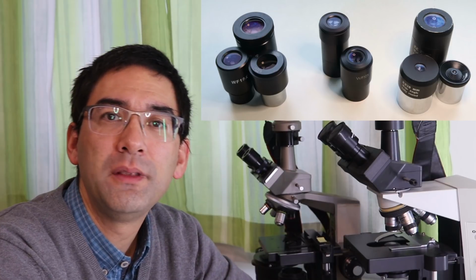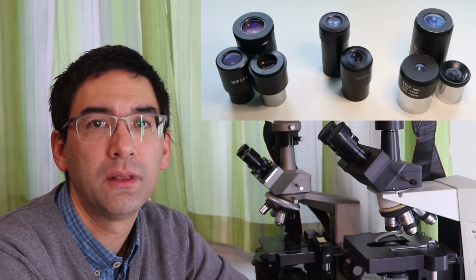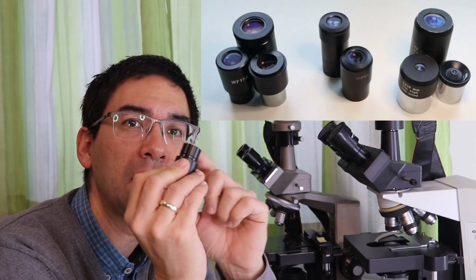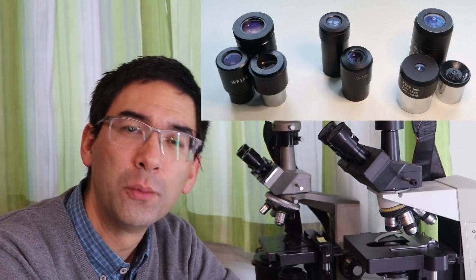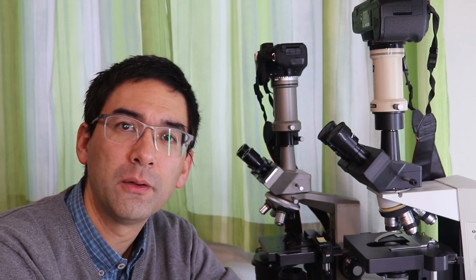In the middle, these are eyepieces for stereo microscopes, and they are not compatible with the eyepieces of the compound microscopes because the diameter is different, so you cannot make them fit. And on the right side, these are eyepieces for telescopes, so I will not be talking about them very much at all because they are again different. They too magnify an image that was created by the objective, but it really doesn't work. You cannot really fit them into a microscope.